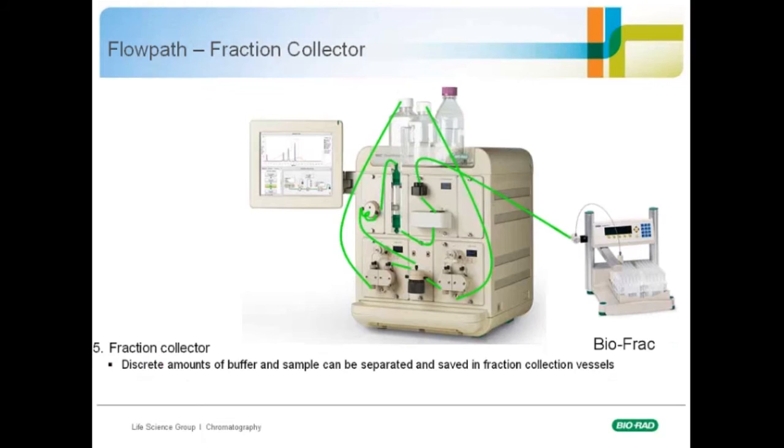Finally, after everything that I've just described, you will go to some type of fraction collector. What we're doing there is we're collecting discrete amounts of buffer and sample, and we're separating those from each other so that we can later analyze those and use those in our research.